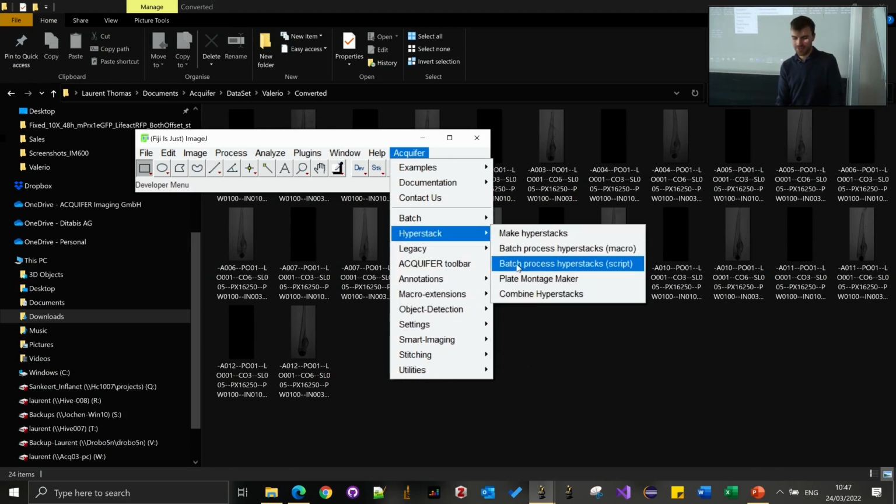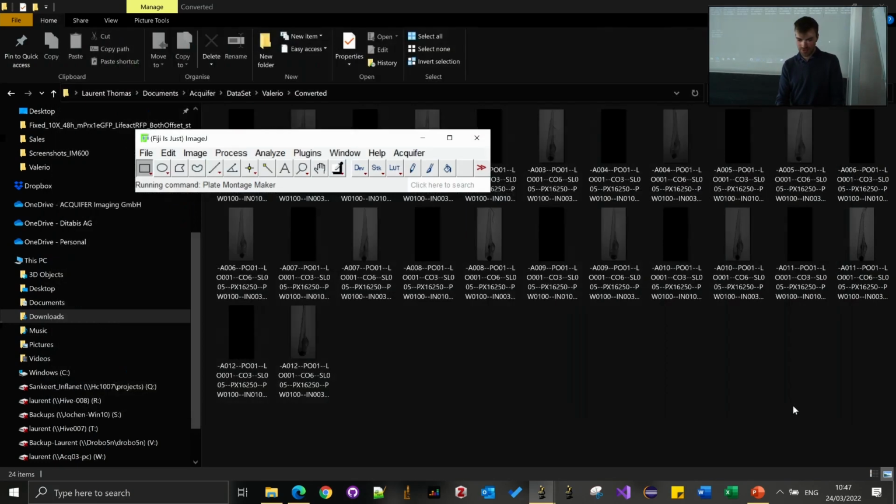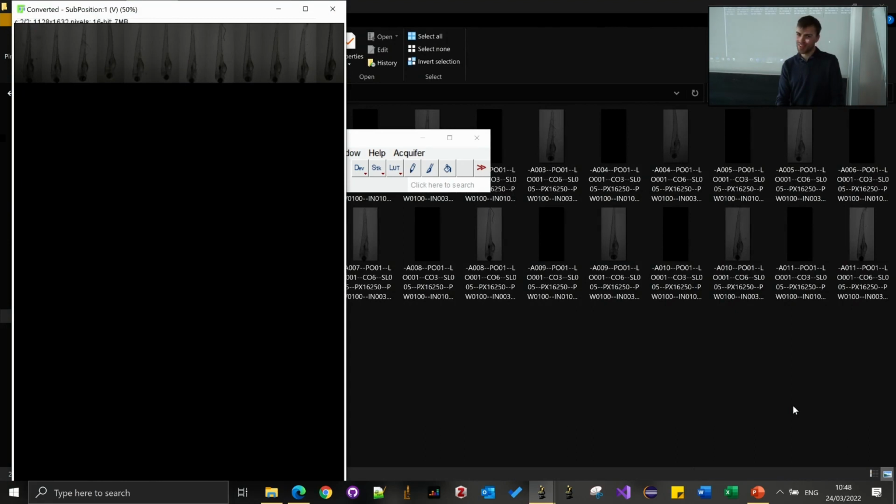let's try that. Hyperstack. Yeah, I got it. Is it there? Well, I did it already, but I wrote it myself. Yeah, having the well ID. Yes, it's working.